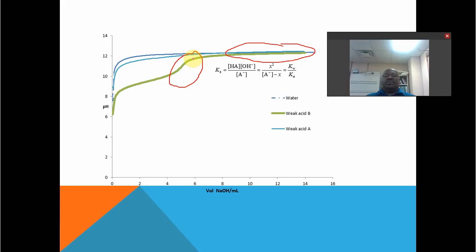If you have a strong acid, the stronger the acid, the more titratable it is, because then you start way down here in terms of pH. So if I'm exaggerating, the weaker the acid, the higher you start, and then maybe that's still titratable. By the time you get here, it's like not going anywhere. So there it is. After you've done it, you'll get some idea of the limits of titratability.